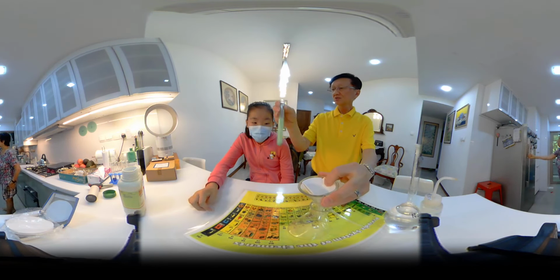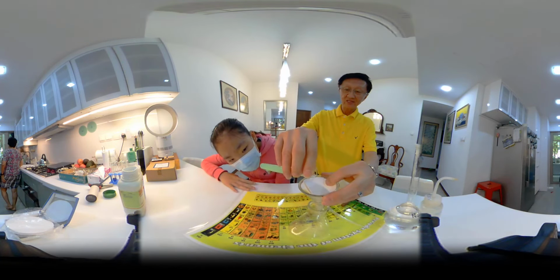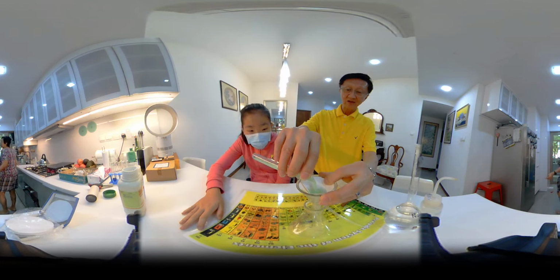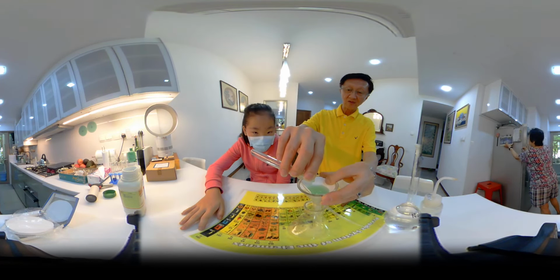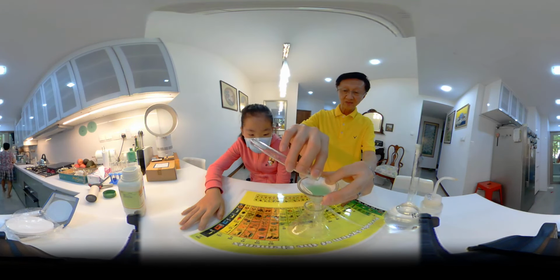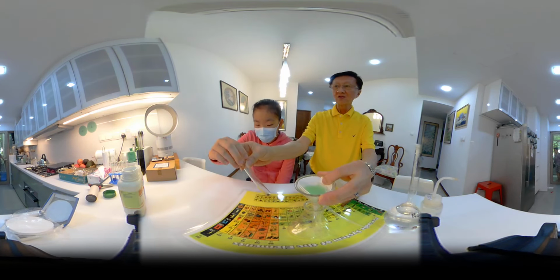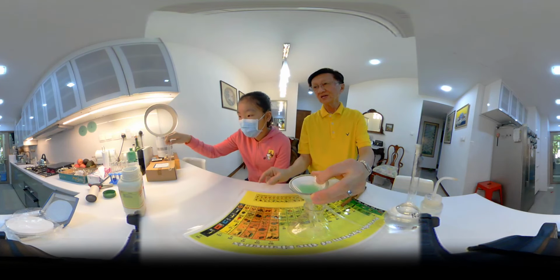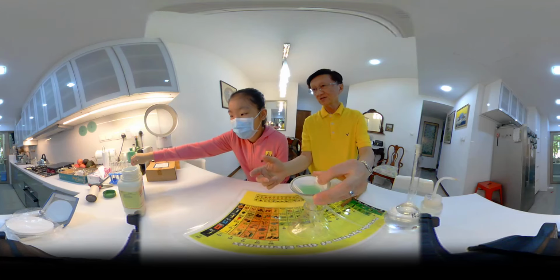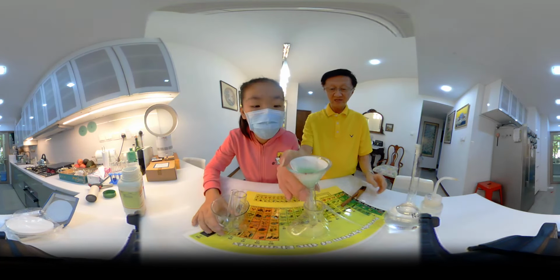You think the solution will still be green? It looks green, right? But let's filter this one out and see. Let's filter. Put it in the beaker. Bring the beaker back. Okay. Can you see?